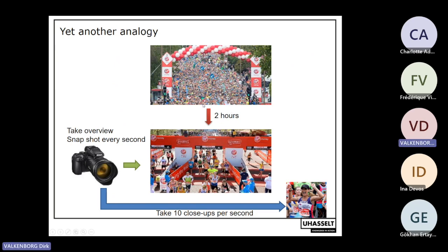So what it will do is separate the participants according to their fitness level, in a similar fashion as a mass spectrometer would separate molecular ions based on their mass and charge. So this gives you some opportunity and some time to try to catalog all the participants of the marathon. So how would you do that? Because at the finish, you see there are 3 exit rows. So what you could do is take an overall snapshot of this exit row, right?